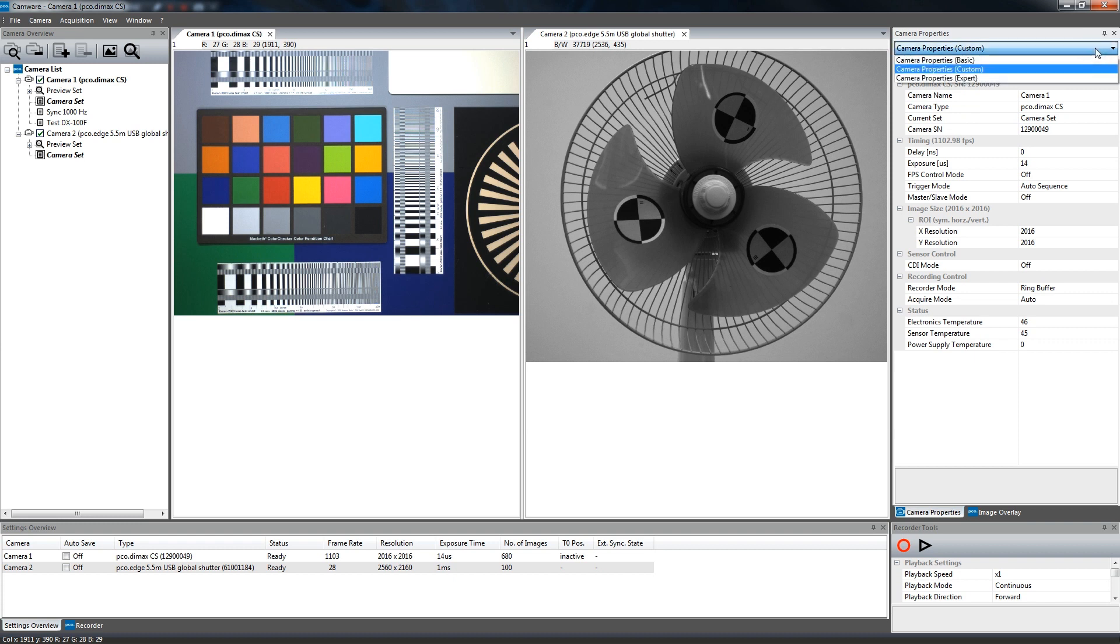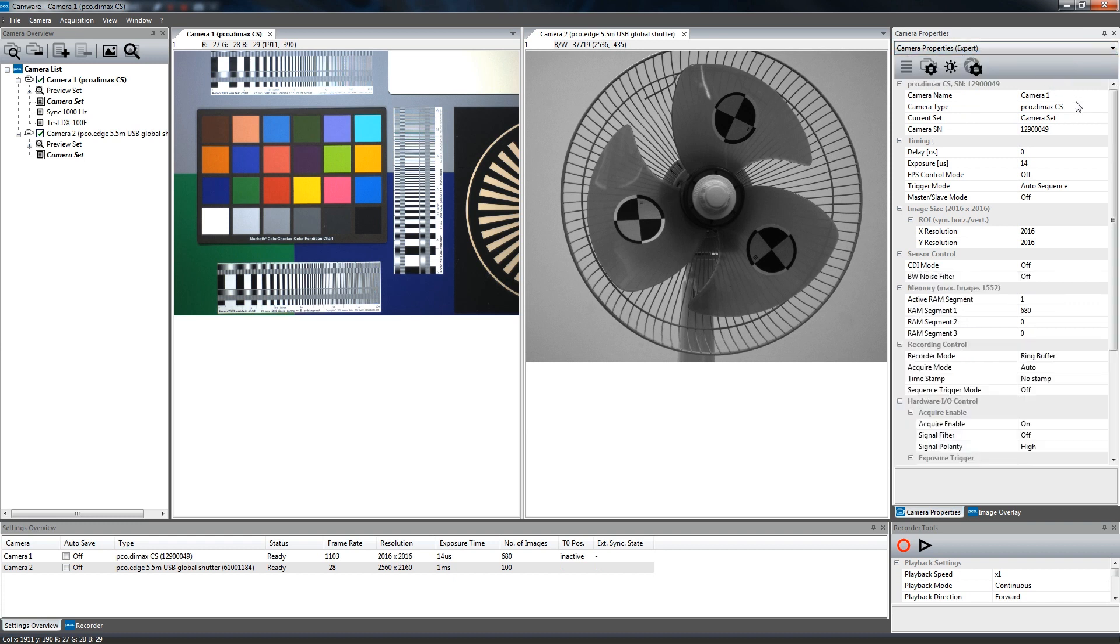The Expert mode shows all possible camera settings for advanced users.